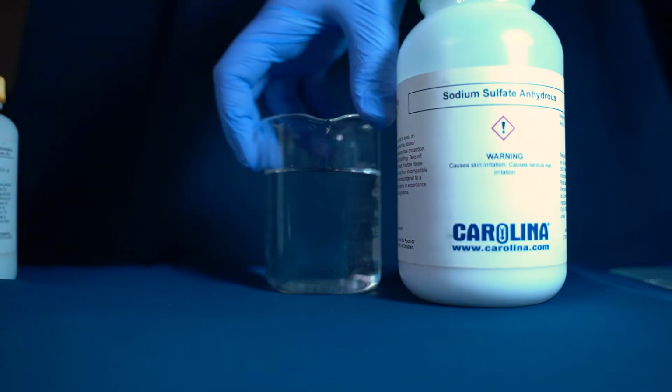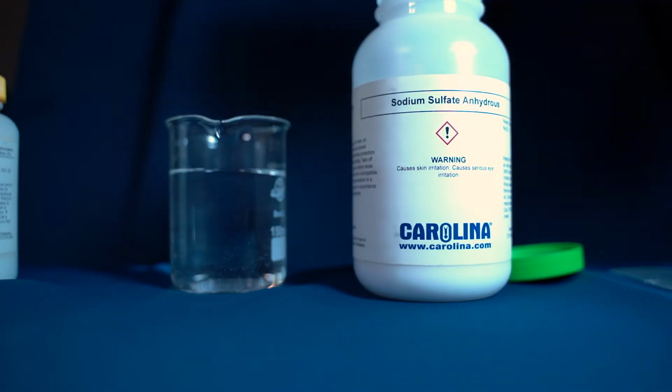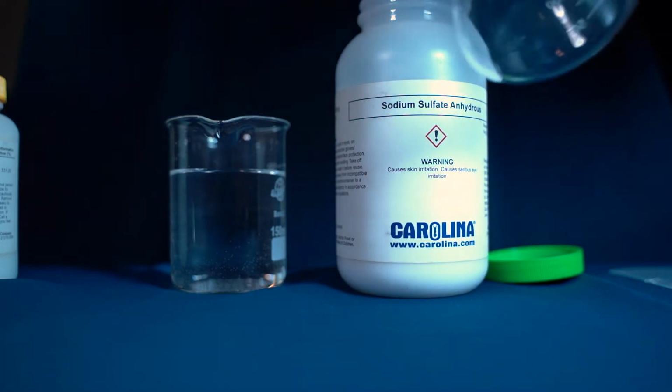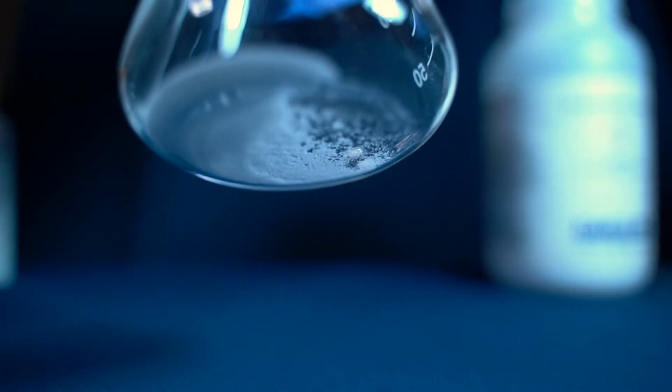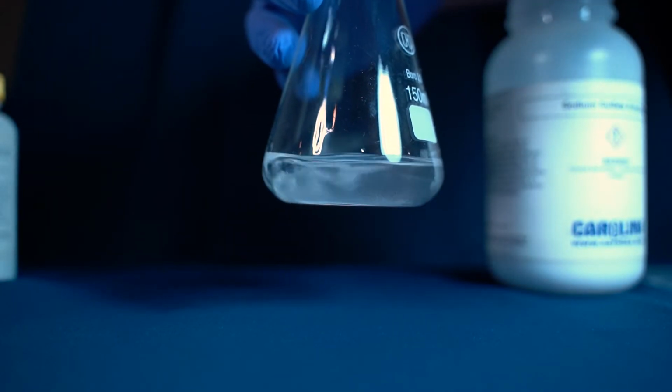First one I'm going to make is the sodium sulfate. So here's my salt, my sodium sulfate. Going to pour about 100 milliliters.